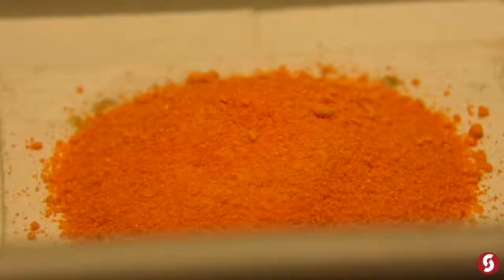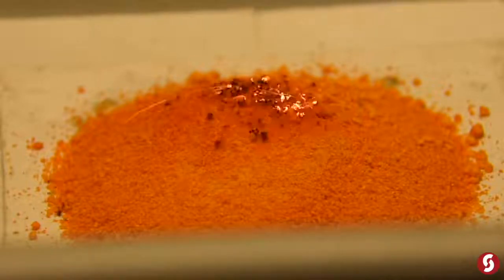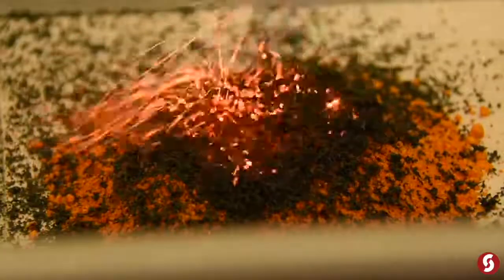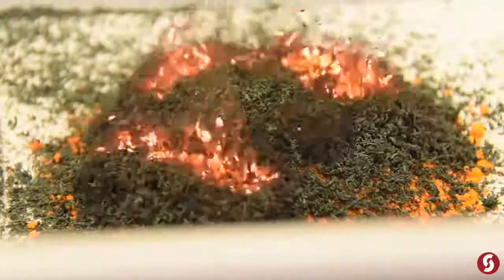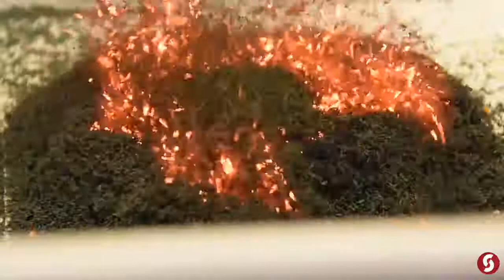Why don't we do another one, except way bigger than that — because that's what we do on Science with Mike. Hopefully we'll have a little bit easier time lighting it. I don't have it in a closed container. Yeah, I think we got it started.